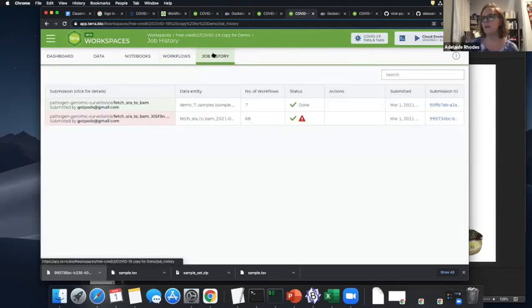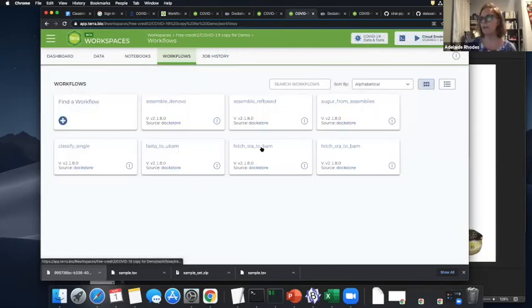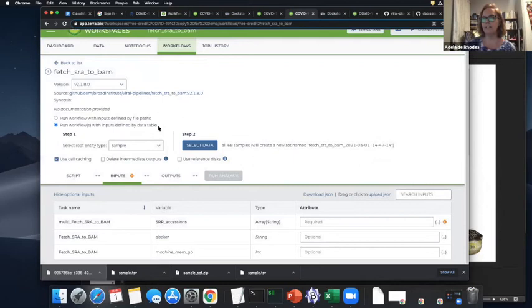All right, so I was playing around with it. This is only an error because I stopped it, but I was just kind of curious what it looks like. So here's another thing. I ran the workflow, the one I was just showing you. I only picked 7 samples, so let me show you that. When you're testing, you may not want to do everything, but oh, here we go.